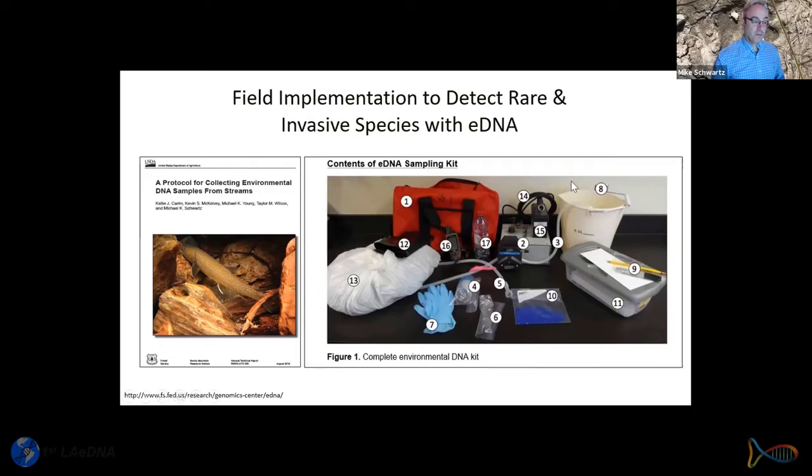And we said, if you're gonna sample with us and if you want us to sample for free, we will send you a pump, which is number 2 in this picture on the right. And we will send you every piece of equipment here. You just send us back the pump after 2 weeks. It was like a library, you have it for 2 weeks. We'll put together all these kits. And so basically we had a small army of people assembling kits in our basement to then send out to our collaborators, and they could follow the directions in the manual we gave them to the left.